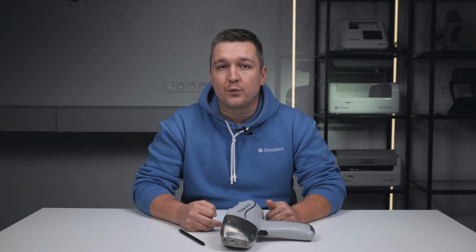It is important to understand that the analysis itself is the same, only the way we display the result changes. So, in short, the mining mode shows elements like ferrum, silicon, aluminum and so on. This is convenient when you are interested in the metal content and good for quick evaluation of the useful component in ore. And the mining oxides mode shows oxides like SiO2 and so on. It is convenient when you work with standards and specifications that use oxide format. It is suitable for cement, glass, ceramics, geology and laboratory batch calculations.